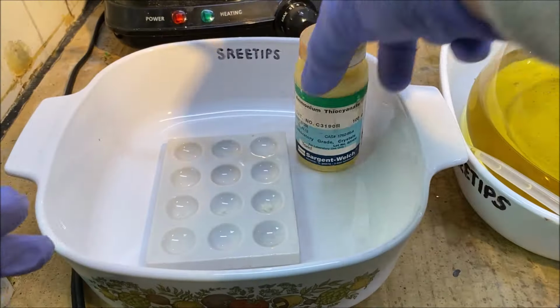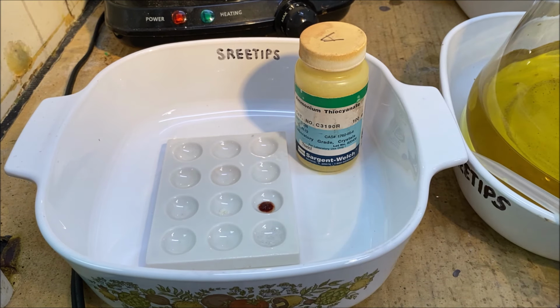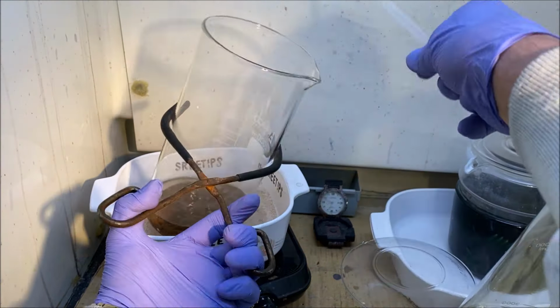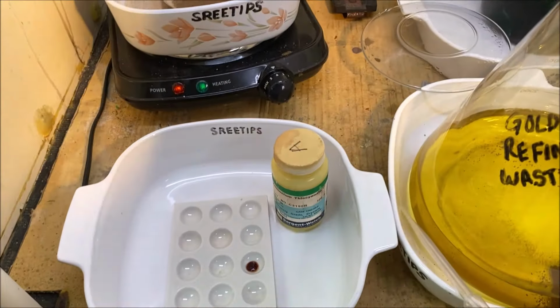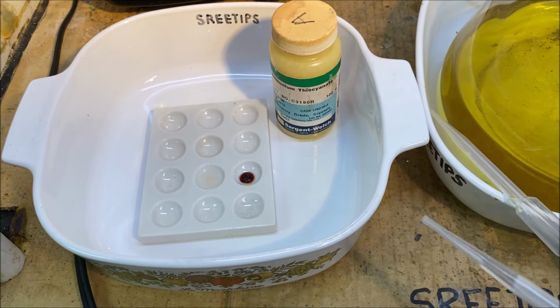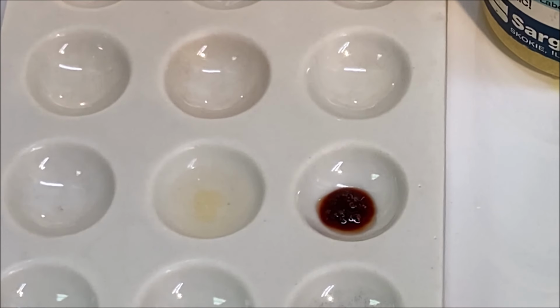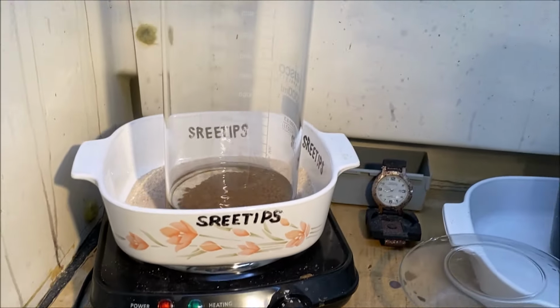Now, this is our known sample. It's got iron in it. You see, it turns blood red. Boom, boom. Now, what we'll do is reach up here to our beaker, the clean pipette, grab some of this liquid in here, and we'll take some of this now, put it on this spot plate, and I really don't see any kind of reaction. I think it's safe to conclude that we've got all the iron out of here now.